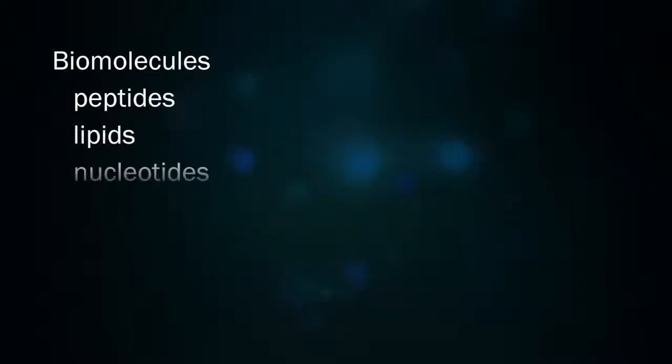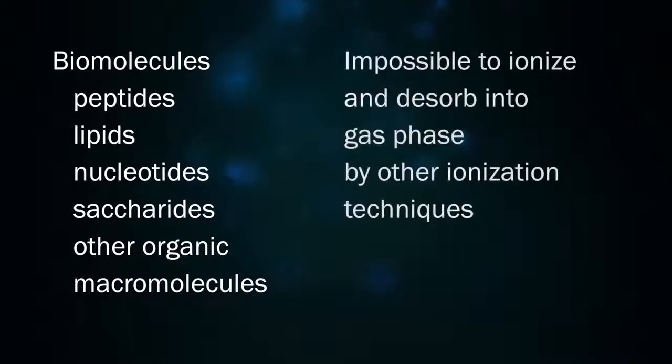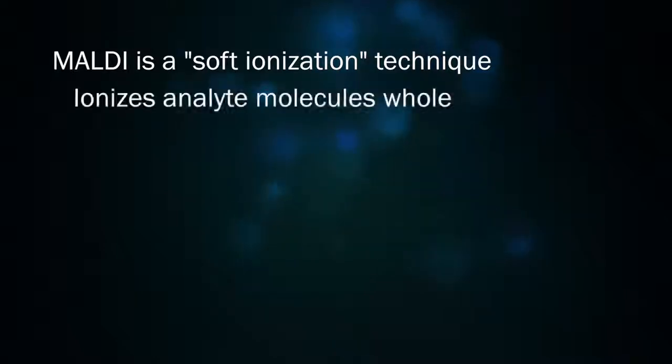MALDI TOF is best suited to analyzing biomolecules like peptides, lipids, nucleotides, saccharides, or other organic macromolecules. Because they're so large and can decompose when heated, traditional ionization techniques like electron impact will fragment or destroy macromolecules. MALDI is considered a soft ionizing technique that ionizes analyte molecules whole.